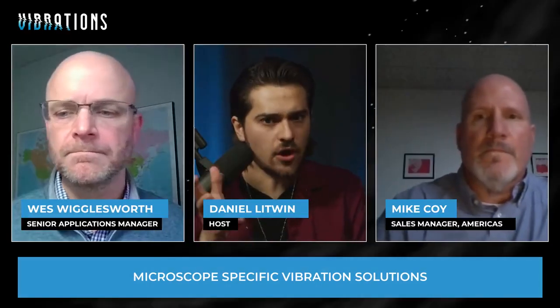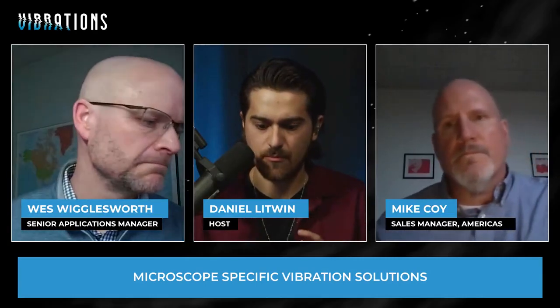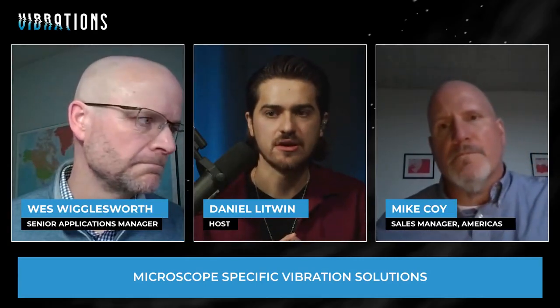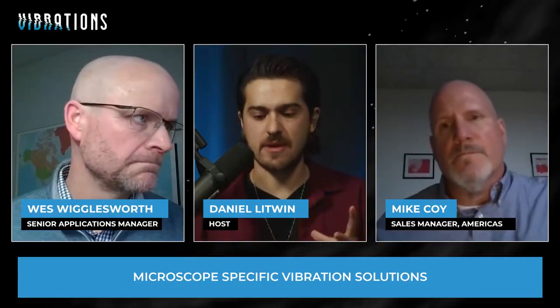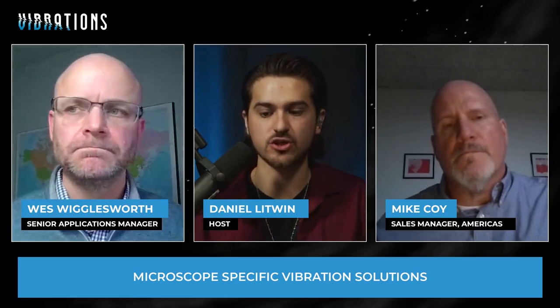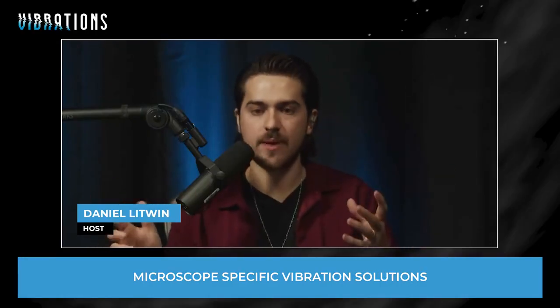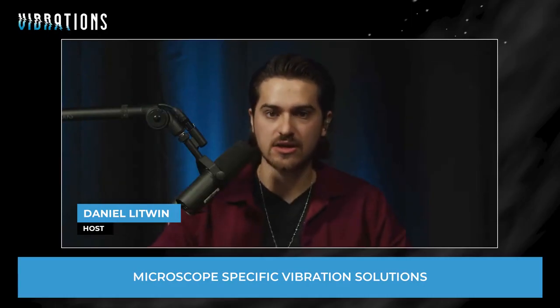I'm curious if y'all have any relationships with the microscope suppliers, right? Or I guess maybe a better way to frame that up is, do any microscope suppliers sell vibration control equipment as part of the whole package, right? Let's say I'm a lab and I buy a microscope from them. Or is it always a separate endeavor, always working directly through, a TMC, for example?